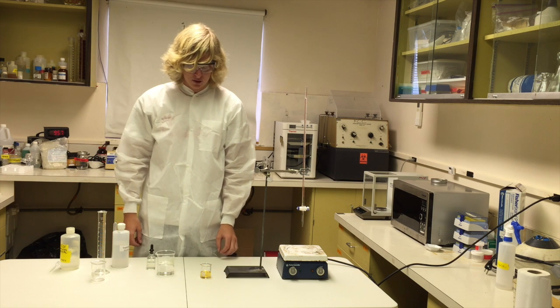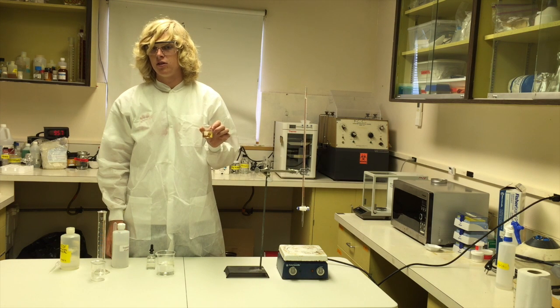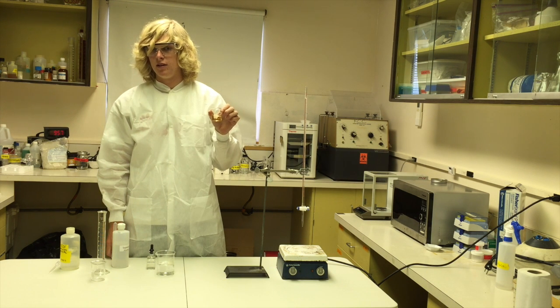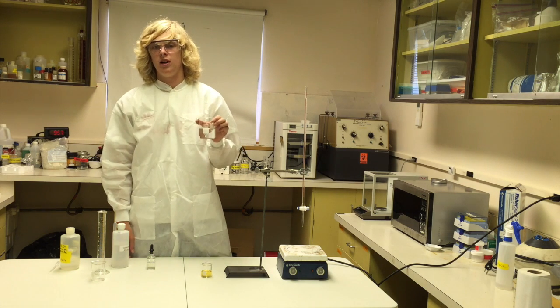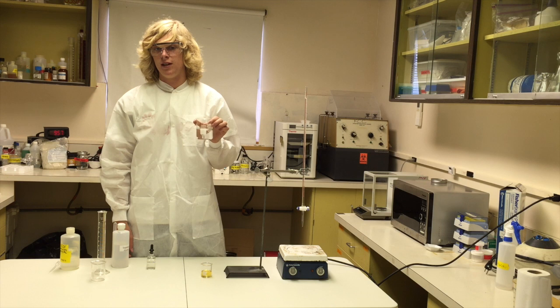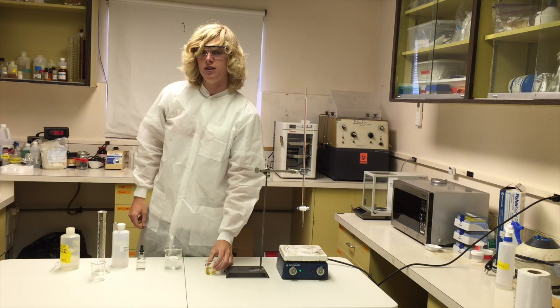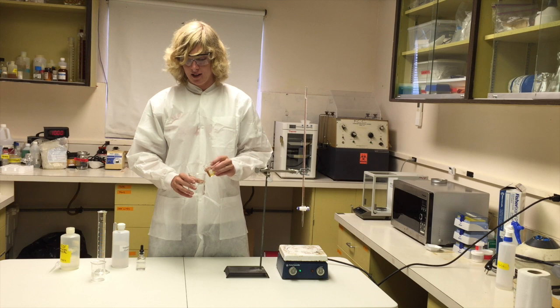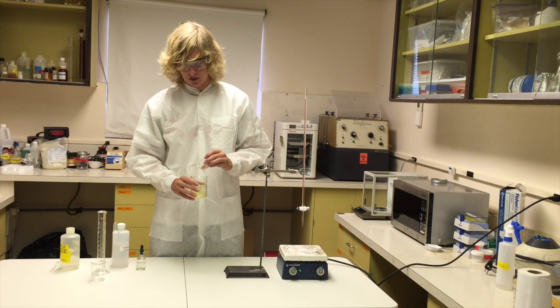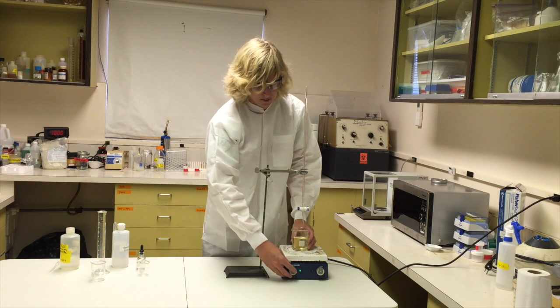For the second part of our procedure, you need to have 20 grams of the biodiesel weighed out. Record the exact weight in the notebook. In addition to that, you also need 125 milliliters of the titration solvent, isopropyl alcohol, with 8 drops of phenolphthalein added to it as well. Next, we're going to take our 20 grams of biodiesel and our 125 milliliters of titration solvent, add them together, along with the stir bar in there. Then you're going to put that on the stir plate and begin to stir.